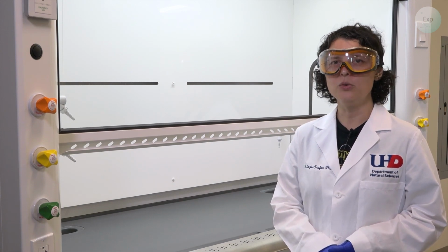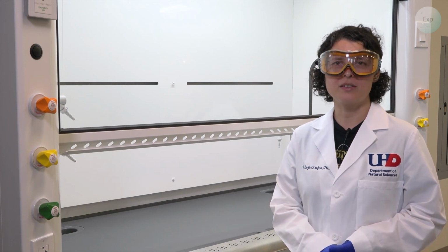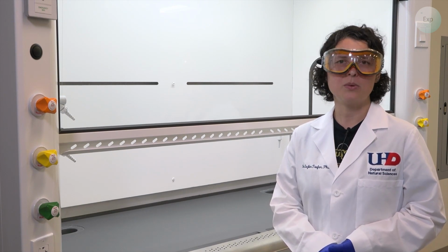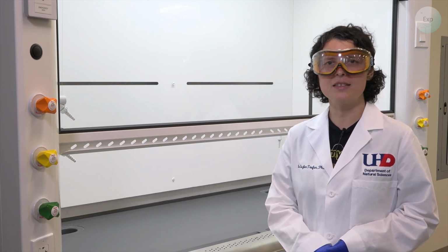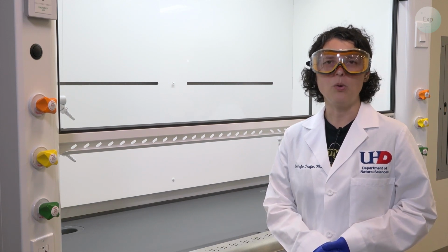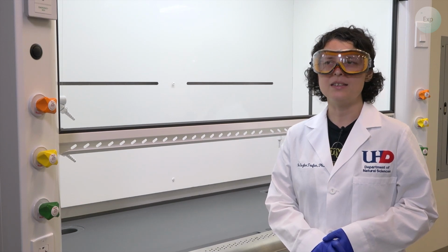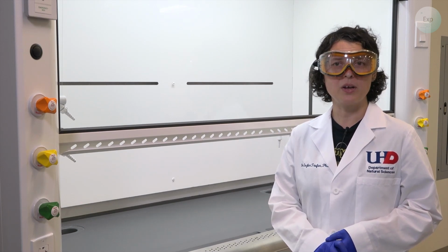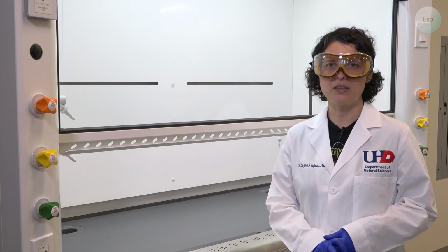But because we are diluting it by a substantial amount, the amount of heat that will be generated through the dilution process dissipates rather quickly, so we don't have to use an ice bath for this experiment. Still, because this is a dilution and we are making a solution of known concentration, the only glassware of choice that we can use here is a volumetric flask. And because we want 100 milliliters of solution at the end, we need to start with a 100 milliliter volumetric flask.